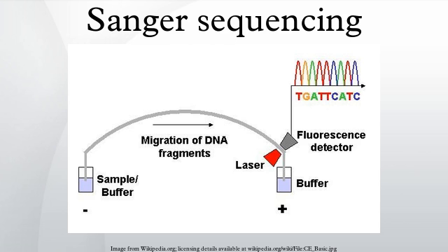In its modern inception, high-throughput genome sequencing involves fragmenting the genome into small single-stranded pieces, followed by amplification of the fragments by polymerase chain reaction. Adopting the Sanger method, each DNA fragment is irreversibly terminated with the incorporation of a fluorescently labeled dideoxy chain-terminating nucleotide, thereby producing a DNA ladder of fragments that each differ in length by one base and bear a base-specific fluorescent label at the terminal base.